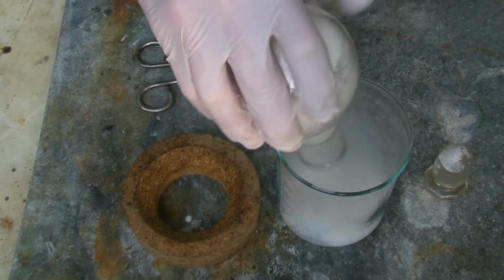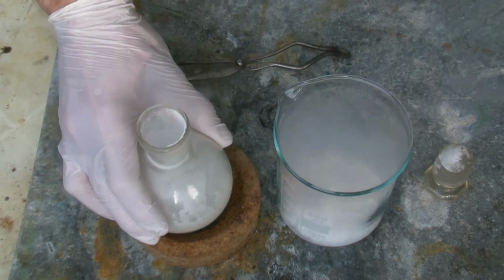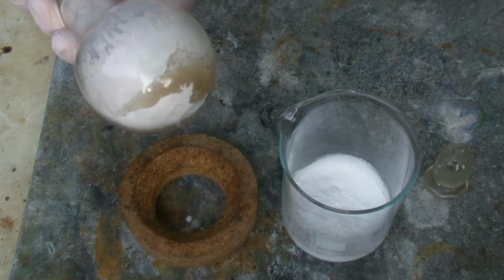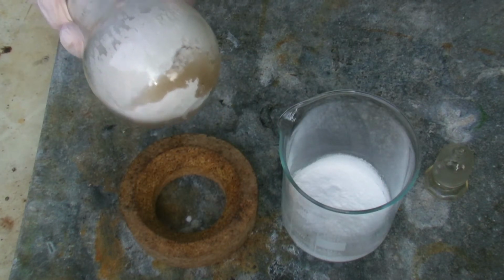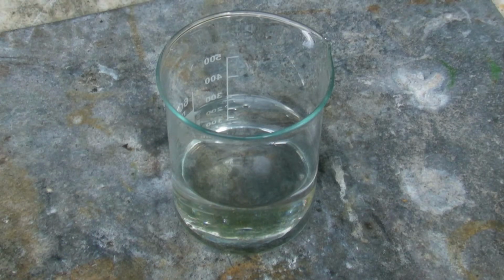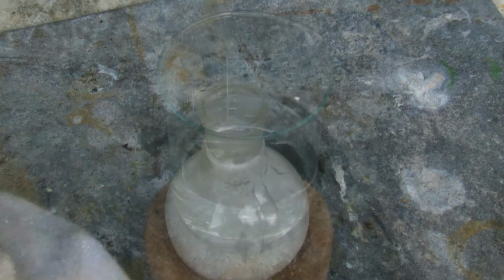The majority of the phosphorus pentoxide could be removed easily. The residue was a tough mass made of polyphosphoric acid and traces of sulfur trioxide. As a test, a part of the mass was added to a large amount of water to find out how violently it reacts with water. It took quite a while until a reaction took place, which could unfortunately only be heard here.